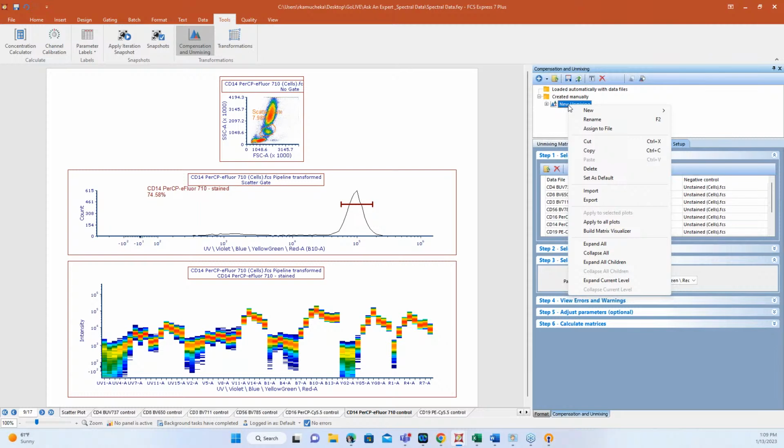So again, very similar to our compensation, you can create an unmixing, you can right click and then export it. I'm a huge fan of doing my unmixing or compensation in separate layouts. Everybody has their own thing. I just get worried about page management, right? For this experiment, I think I have like 15 pages if I do my unmixing. So I like to keep those in separate spaces, export out my unmixing, and then import it into a new workspace.